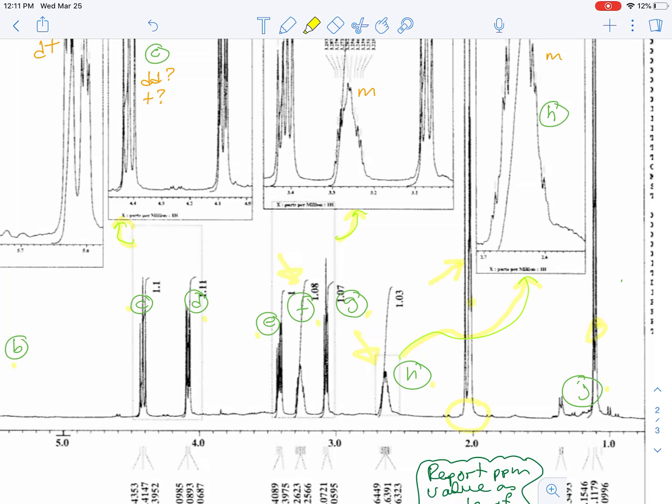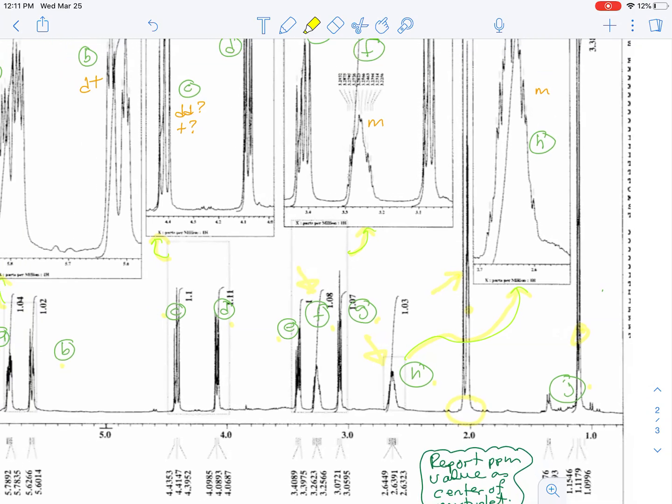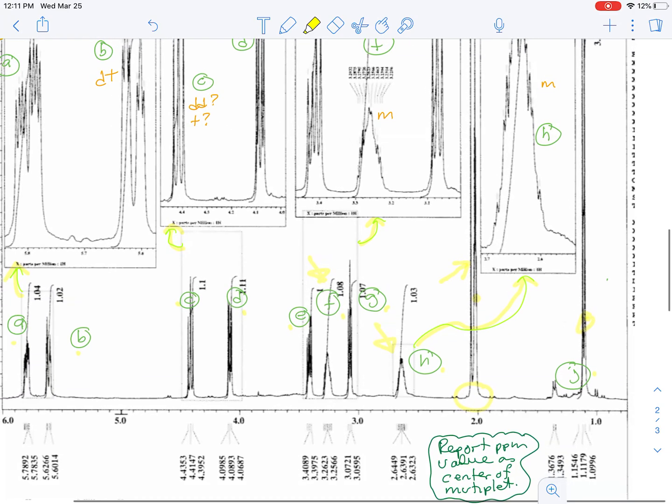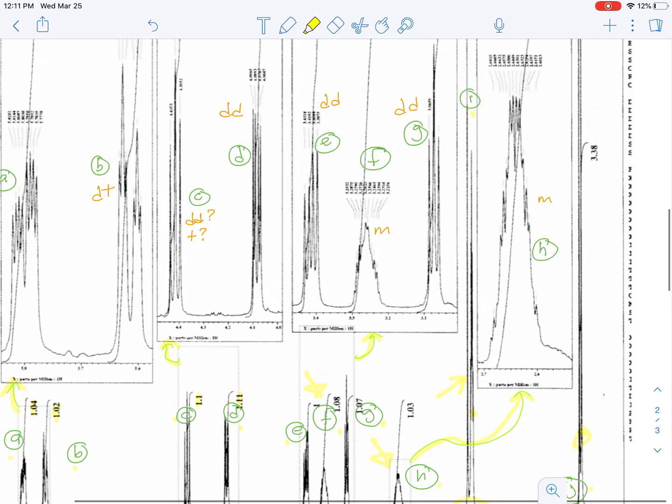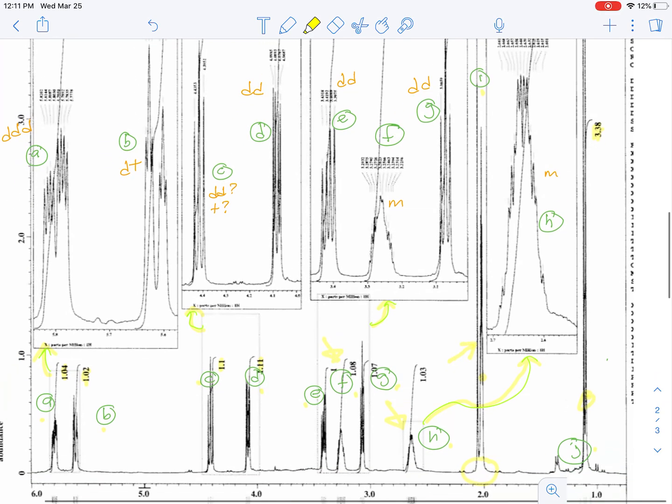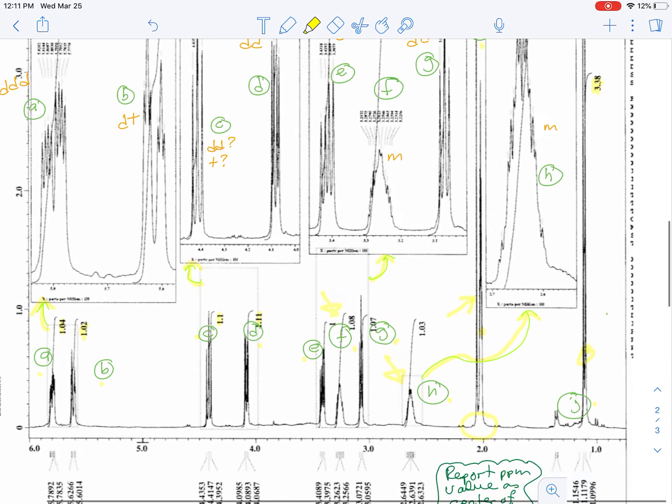This signal here is actually the residual D5 in the acetone D6, and so we're going to ignore it. And if you look at all these integrations, you see by and large they're all about one, except for the signal for the methyl group which is just over three, but there's some junk down at the bottom so we're going to call that about three.